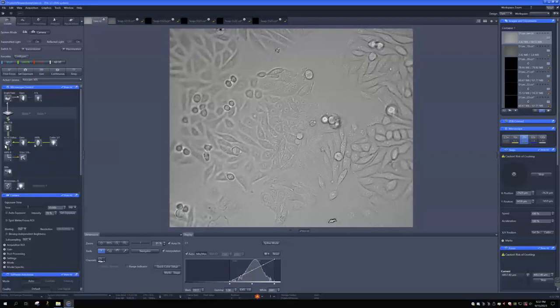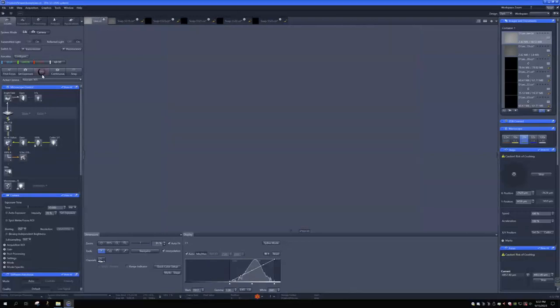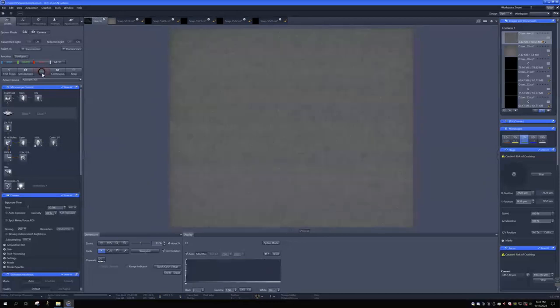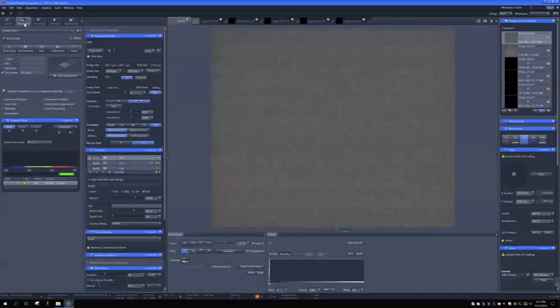And you can see the light going through the reflector, going up to the objective, to the sample, and then reflecting back to the camera. So we can now do the live imaging. You can see here pops up the color, black and white. The white is the fluorescence of the TMRE. So now we are sure the TMRE is working. So we turn off the LED, stop imaging, and then go to the next step, acquisition of the image.